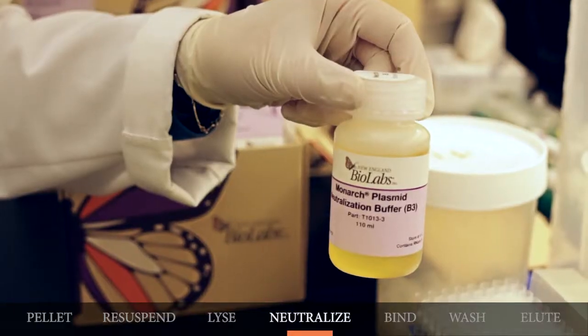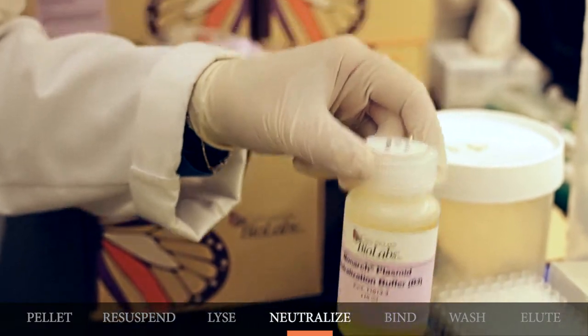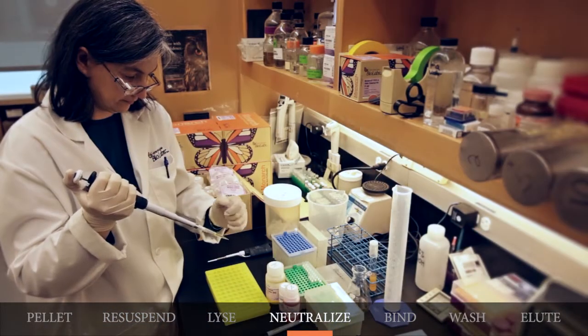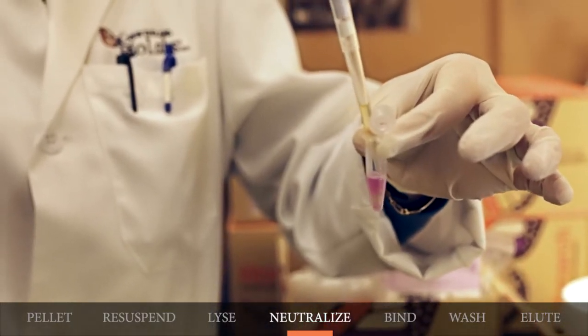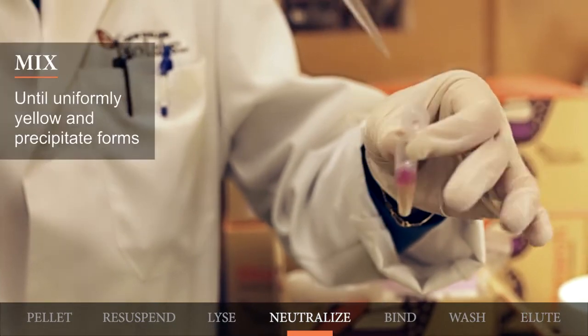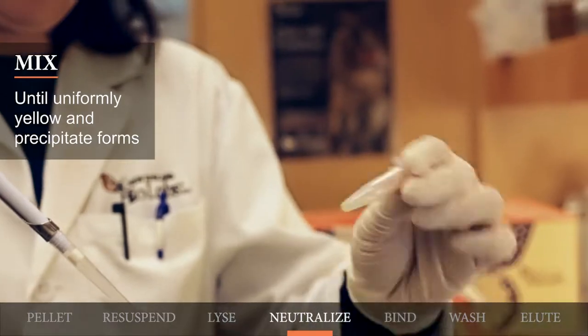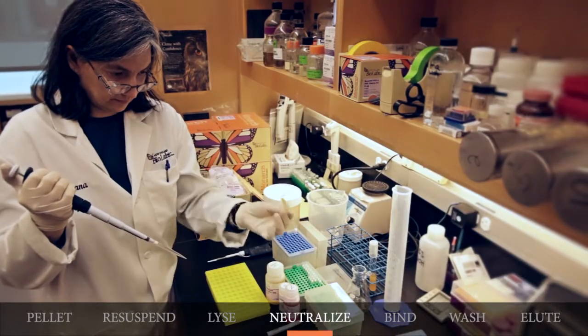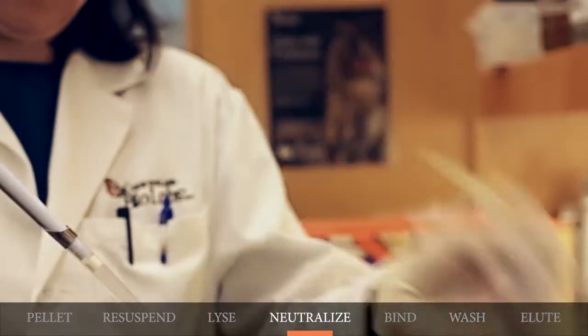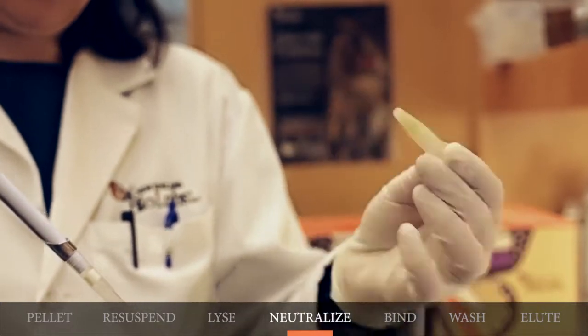To neutralize the lysate, add 400 microliters of the Plasmid Neutralization Buffer B3. Again, gently invert the tube five to six times until the color is uniformly yellow and you see a precipitate form. It is very important that you mix the solution until the color is uniformly yellow. Please do not vortex the solution.